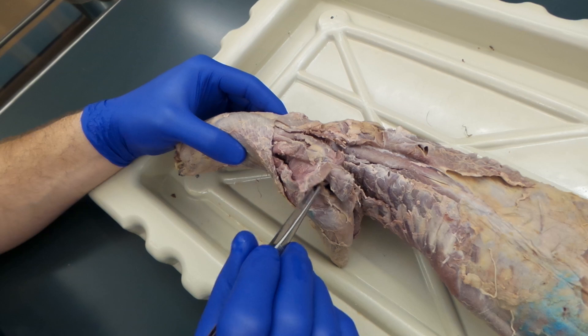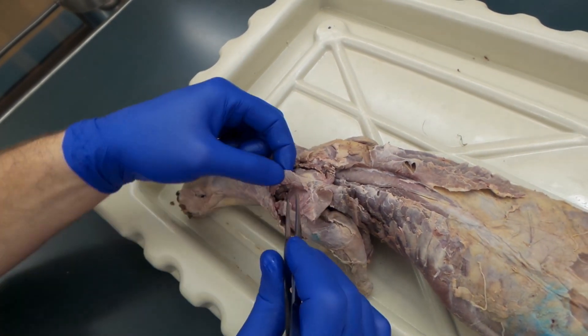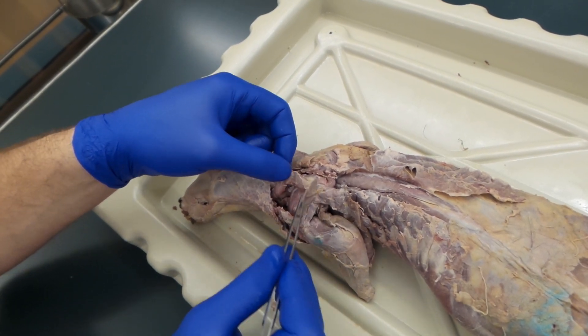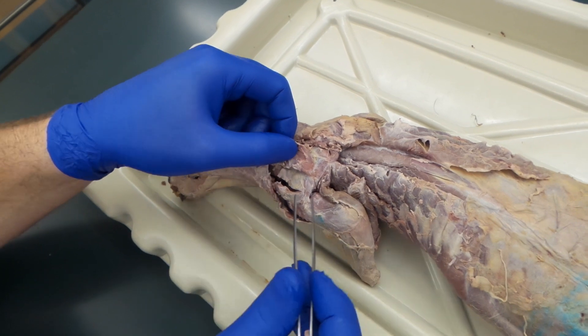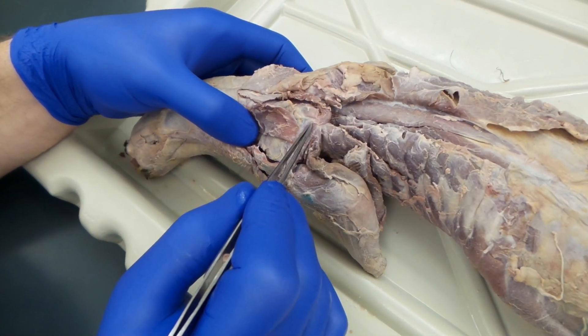What we left intact is the rhomboideus capitis. This muscle right here is called the atlantoscapularis — you don't need to know it for this first year. New muscles: in between this muscle and your levator scapulae, you have your supraspinatus.